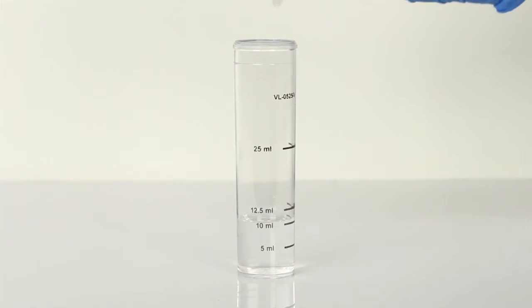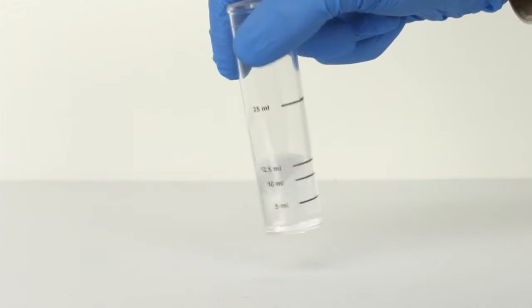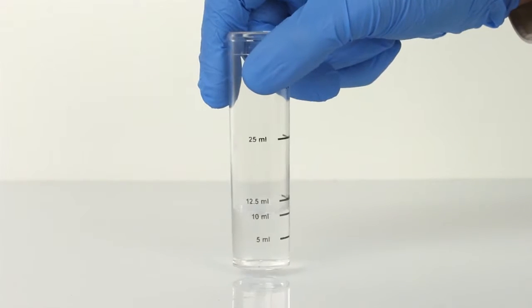The next step is to add 8 drops of nitric acid 20%. The bottle contains a dropper tip, so it's important to hold the bottle vertically to get a consistent drop size. After the addition of each reagent, swirl the vial to make sure the reagents are properly mixed.